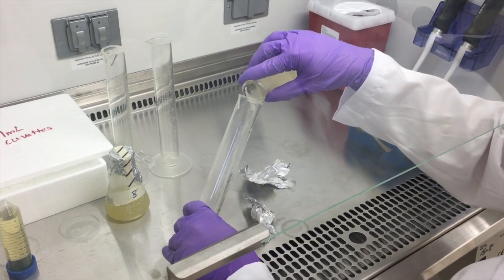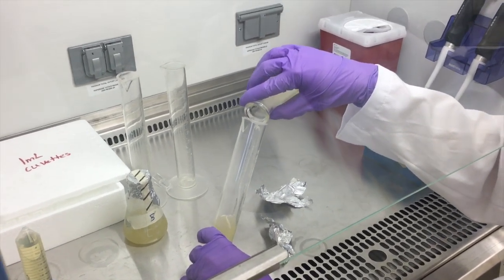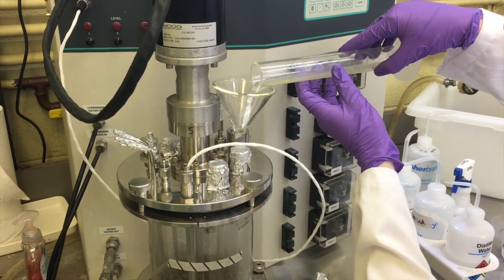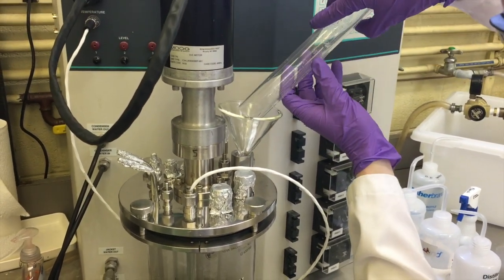Once the media has reached the set temperature, pour 50 milliliters of the inoculated sample into a graduated cylinder. Pour the sample into the reactor using the same funnel.